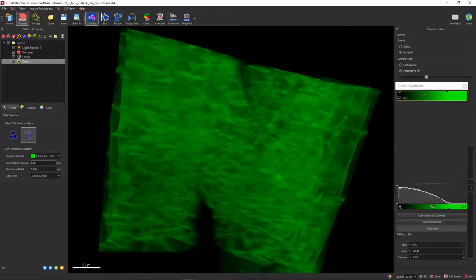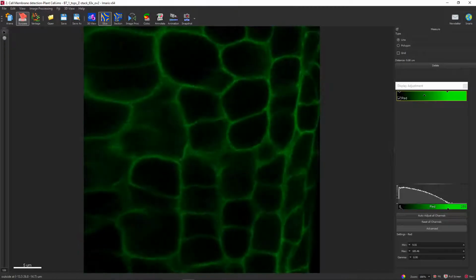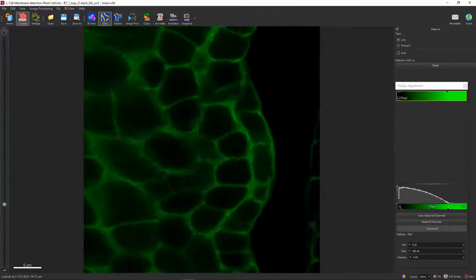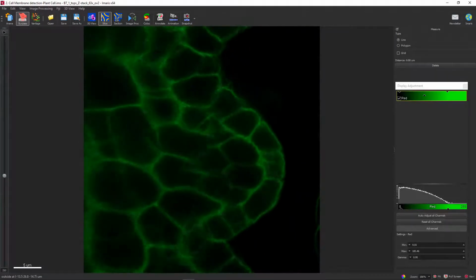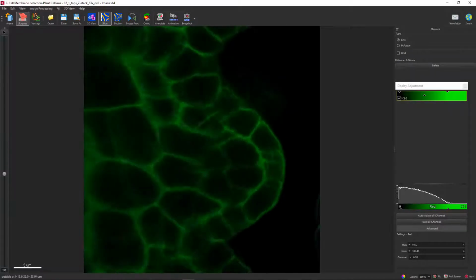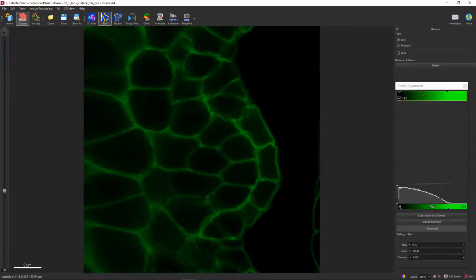Smallest cell diameter, let's measure them again in the slice view. When you have a 3D scan or a time lapse, it's really good to go through the stack and through the time to really look for those smaller ones. Because, for example, here are rather big cells. If I measure those, I can completely exclude anything smaller.